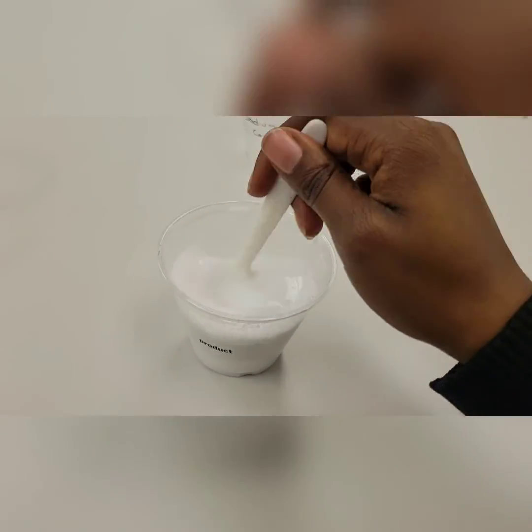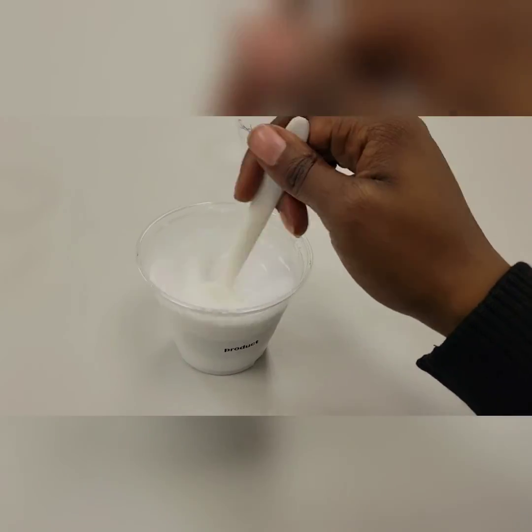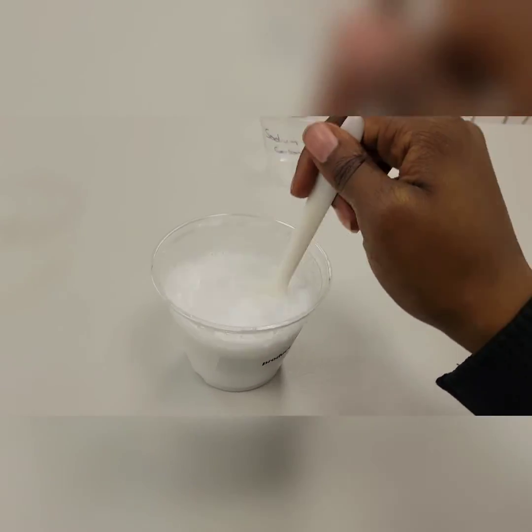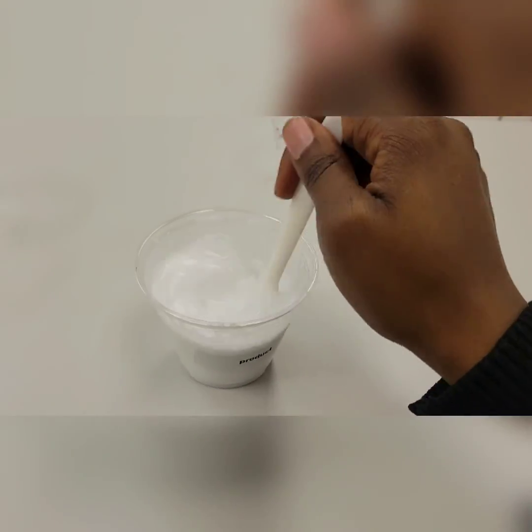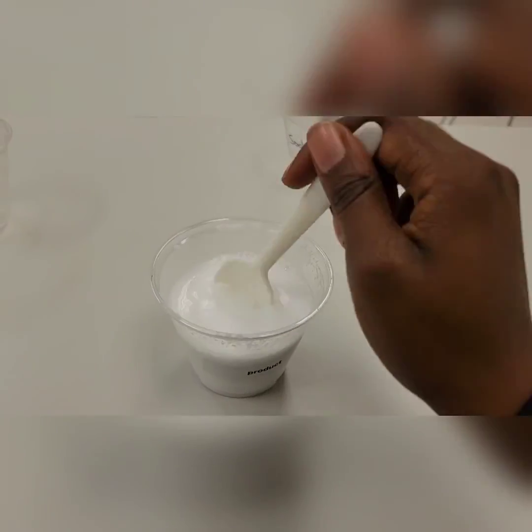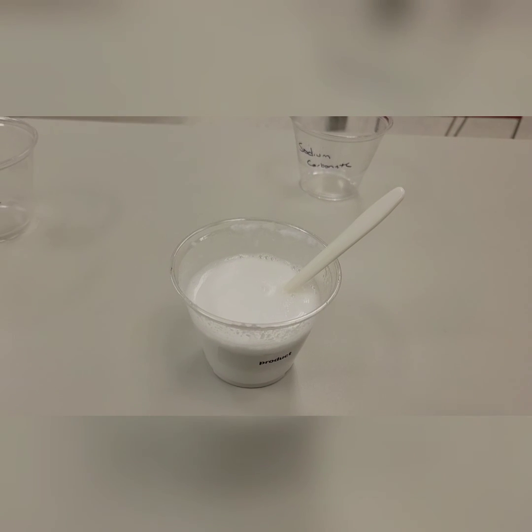Okay, so there you have it. Hope you guys were able to notice what happened and be able to determine whether or not there was a change in our initial substances. Make sure you write down all of your observations.